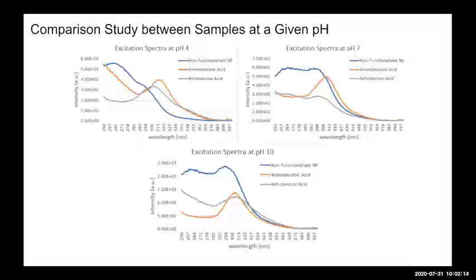Could you repeat that? Okay, you have a nice clean experiment here where you're testing the different pHs and you're getting a spectra. Would it be different in practice? So I think it depends on which, so completing the excitation scan, you need to choose an emission wavelength to scan it from.